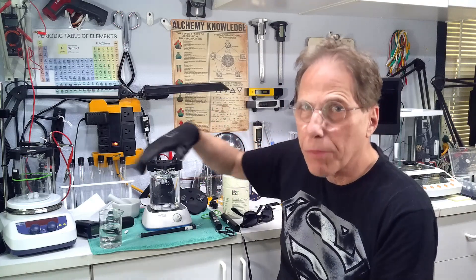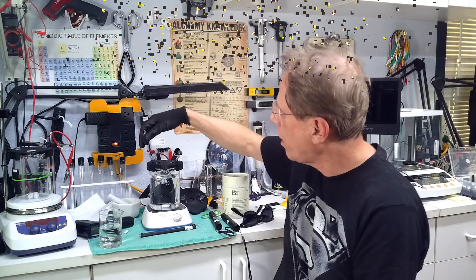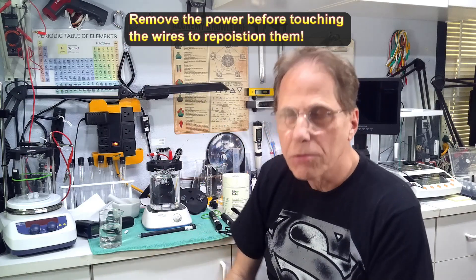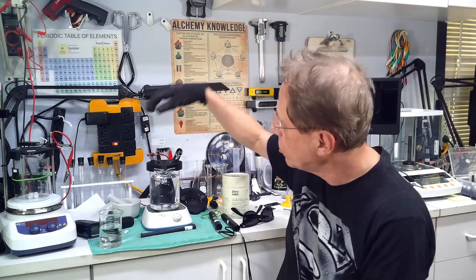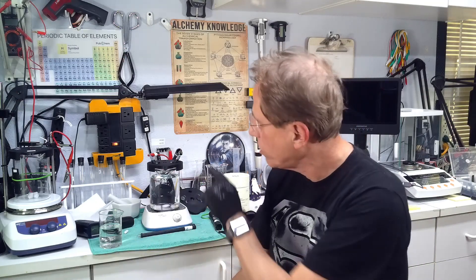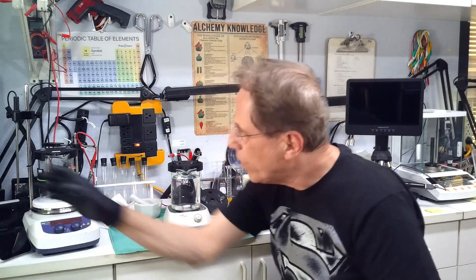One important safety tip for repositioning wires: if the plasma arc goes out and you need to reposition, never touch the wires while they are energized. Take your foot off the dead man switch, reposition the wires, then press the switch again. If you need to reposition again, lift the switch first. Get into the habit of doing it this way. Even with gloves on, do not touch the wires while power is energized.